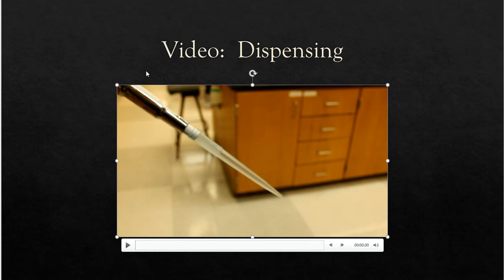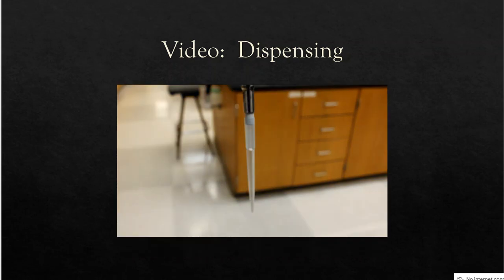Okay, so you're probably asking why micropipetters. As you can imagine, the more you use these, the more comfortable you're going to get with them, and it makes it very quick to deliver volumes versus an old-fashioned glass volumetric pipette. Don't get me wrong, we still use those. We use those all the time. But if I just need something very quick and convenient, just maybe a one-time-only kind of thing, folks, a micropipetter is the way to go almost every single time in a lab.